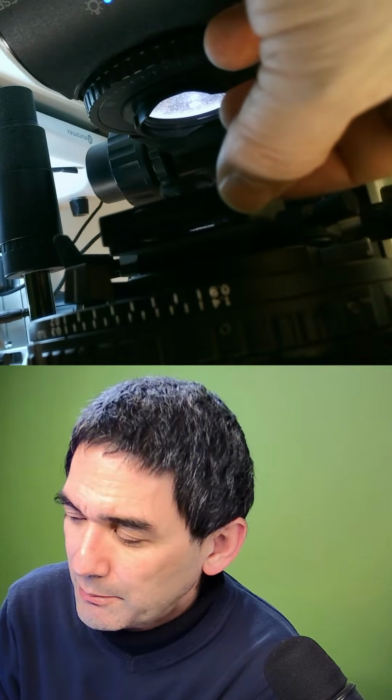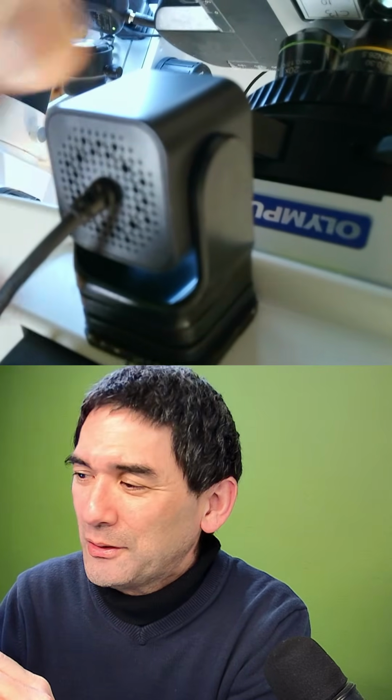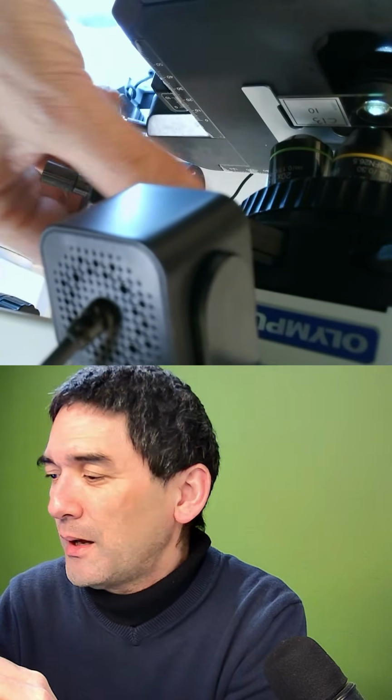That adds the polarizing filter, and then there's another thing that I have to go up here. By the way, this thing here at the top, I glued the camera on here so that you're able to see the stage, right? And there is this thing here that contains a prism.